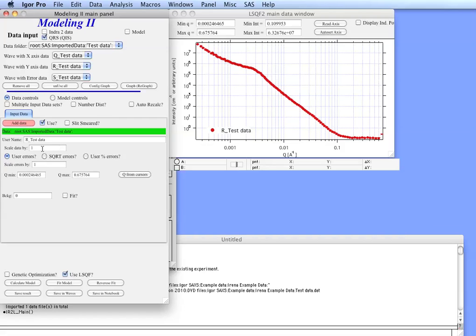We can scale the data in case we need it. We can use our error estimates which we have loaded in but we could actually create some of our own. You can scale the error bars if you need to create larger ones.